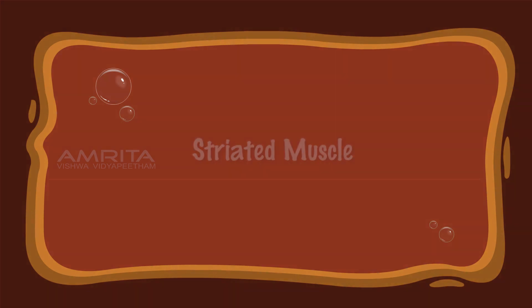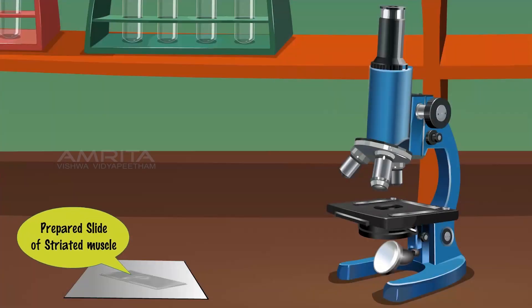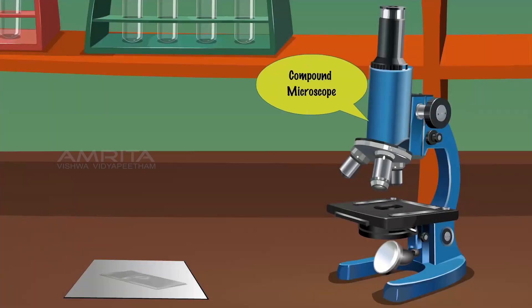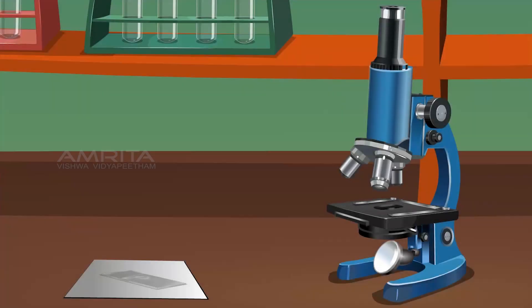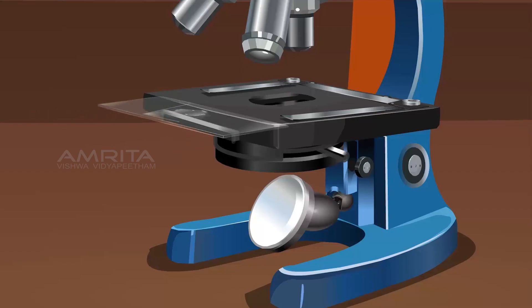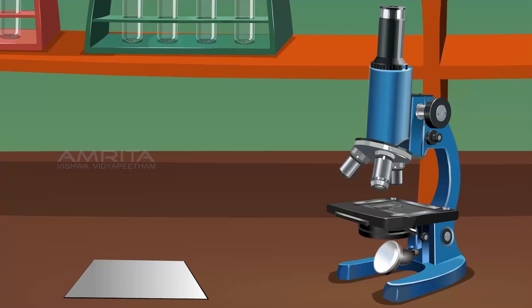Striated muscle. Materials required: prepared slide of striated muscle tissue and a compound microscope. Procedure: Place the prepared slide of striated muscle tissue on the stage of the compound microscope. Observe the features of the striated muscle tissues through the lens of the compound microscope.